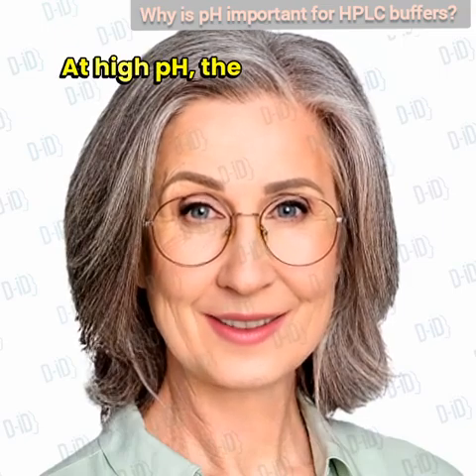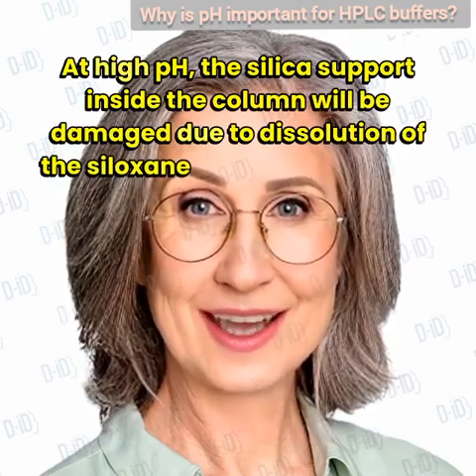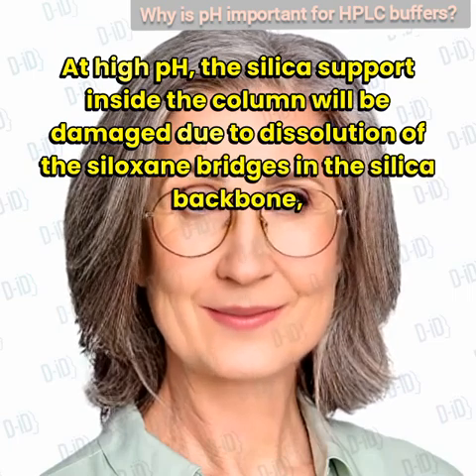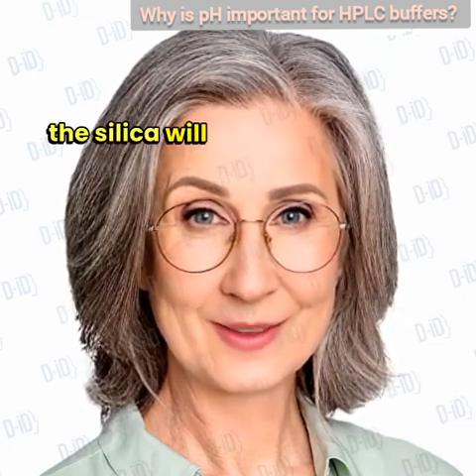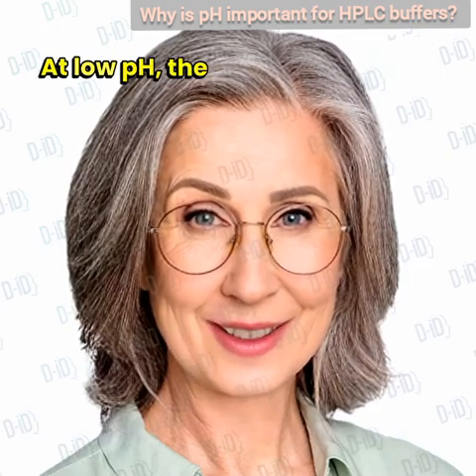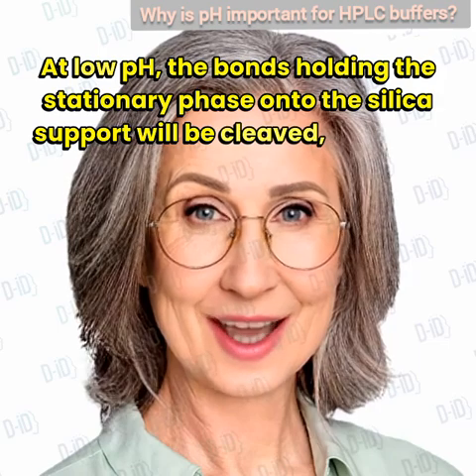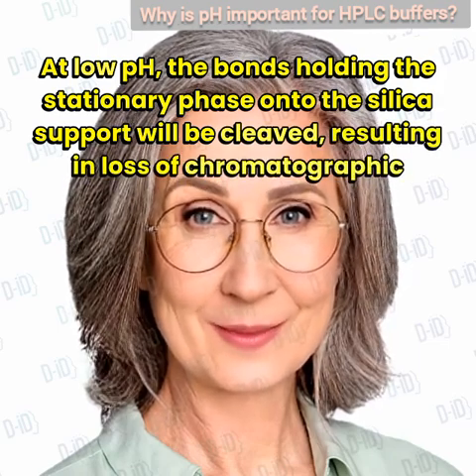At high pH, the silica support inside the column will be damaged due to dissolution of the siloxane bridges in the silica backbone. The silica will start to fall apart. At low pH, the bonds holding the stationary phase onto the silica support will be cleaved, resulting in loss of chromatographic performance.